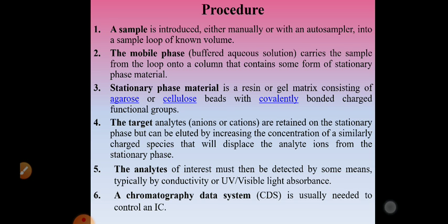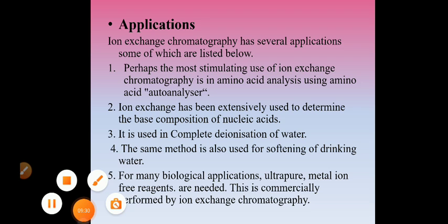Now let us discuss the applications of ion exchange chromatography. It has several applications. Number one, the most important application of ion exchange chromatography is amino acid analysis of a protein.